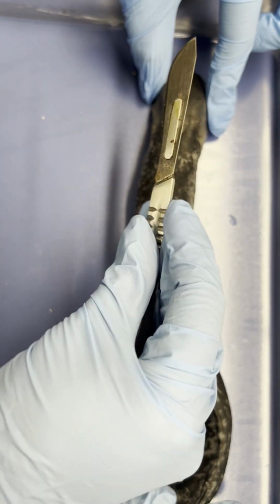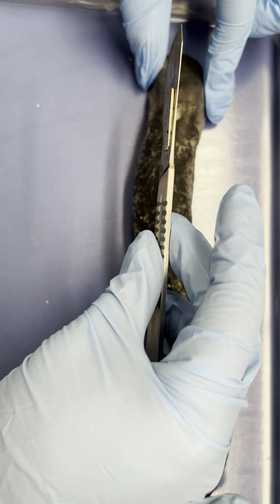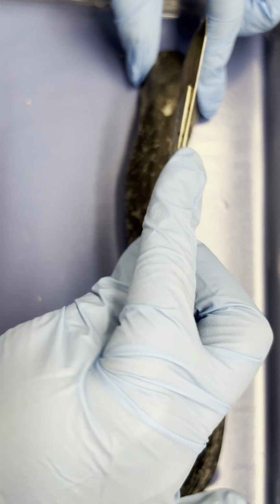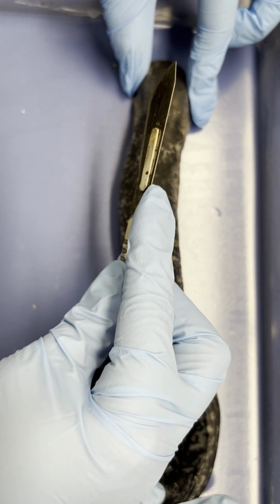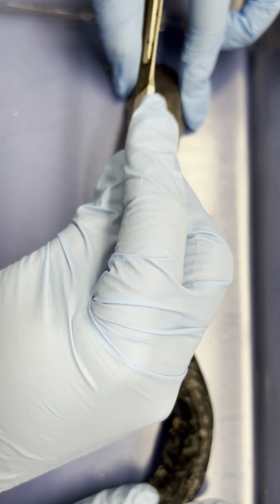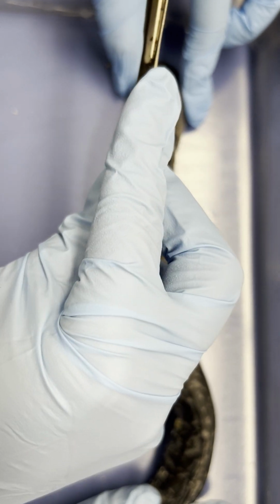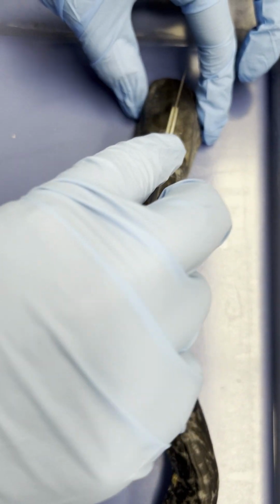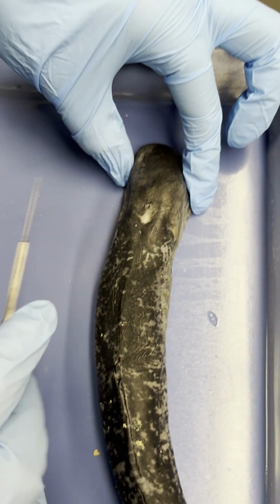When you're using your scalpel, you want to be very careful, but good handling. You want kind of a finger on each side of the handle, and you have more control over your blade, and you're less likely to hurt yourself if at the top of your handle, the dorsal part of your handle, you keep your finger there. So you want to, again, be very careful, but we're going to go along dorsal midline.